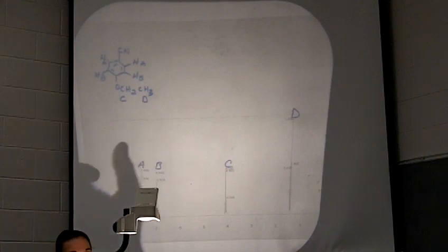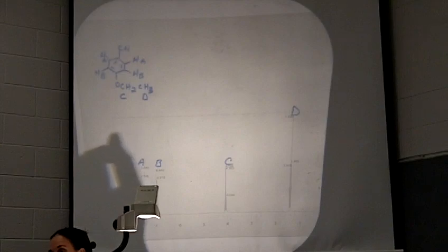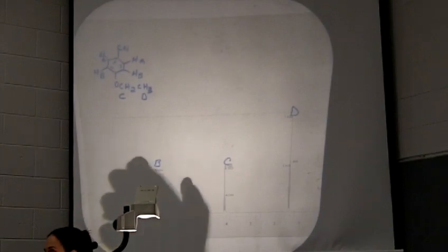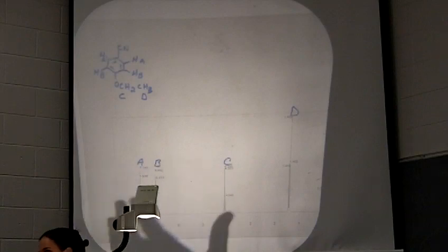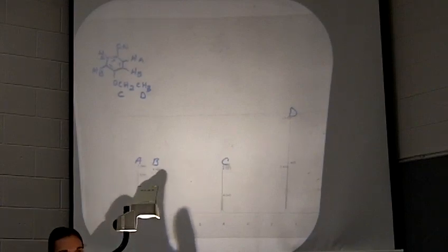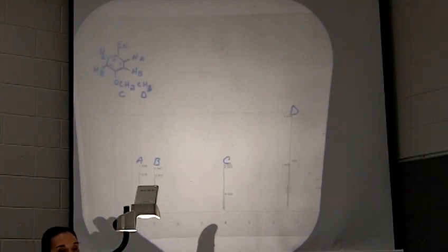All right, so that's where it comes into play as far as the aromatics, figuring out which signals belong to which when you've got something like para substitution, where you don't have a splitting pattern or anything like that where you can figure out what is what, or integration, because they're going to integrate to 2 and 2 and they're going to have the same splitting pattern, all right?